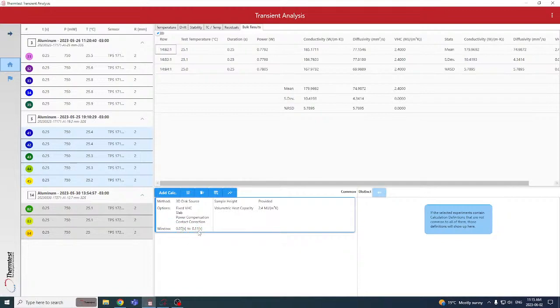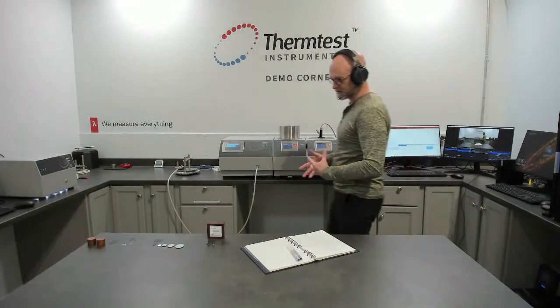So that gives you an example of using the same time and the power of being able to chop points from the back of a 0.25 second test to simulate shorter test times, all the way down in this example to 0.1 second, and still be able to make measurements at that full scale. So of course there's a wide variance of test times, but hopefully this is one good example of the importance of test times and what it means to the flexibility of your instrument.